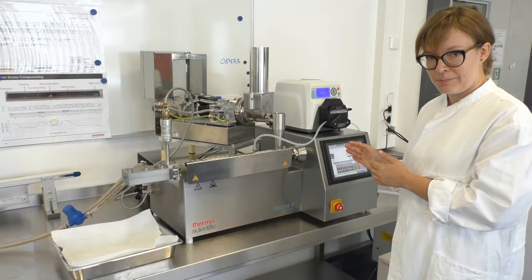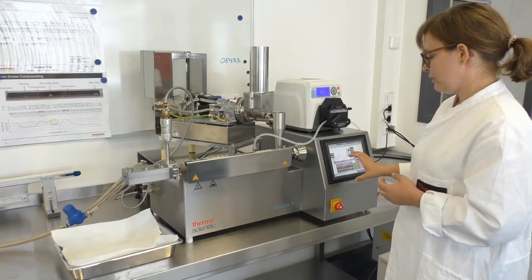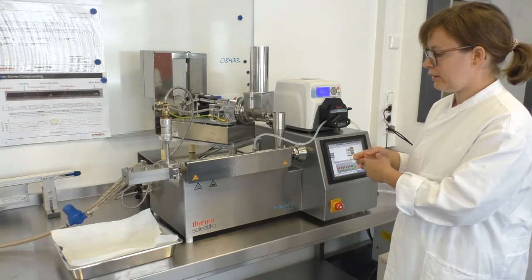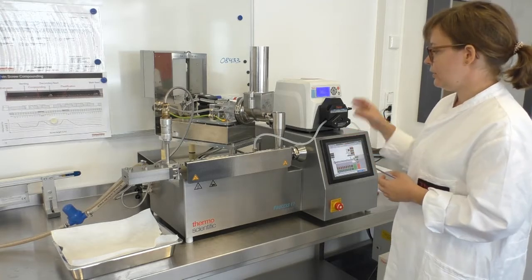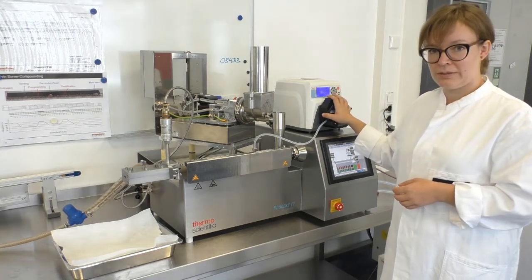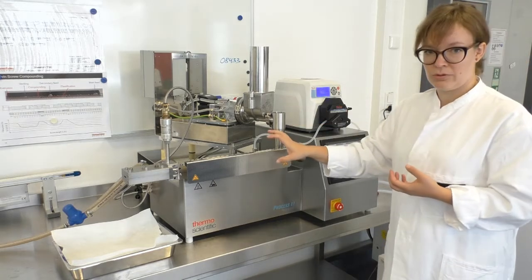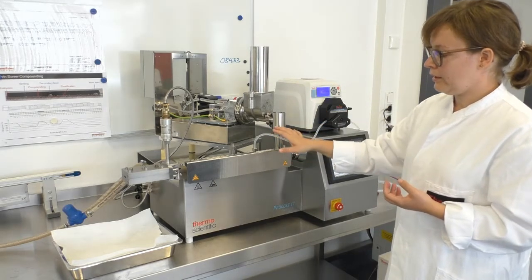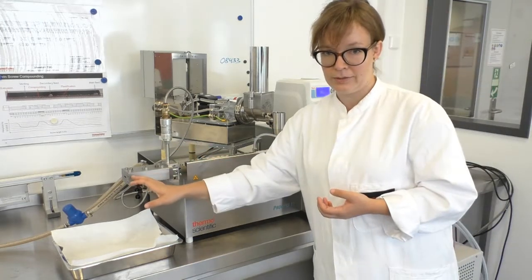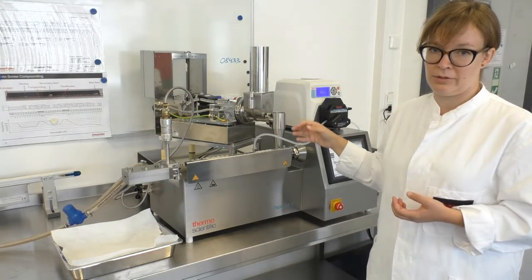So, as the next step, now I want to start running the process. What I would do first is start the extruder by letting the screws rotate, and then the next step is that I start with the liquid feeding. And here it's important that we always start with the water, because this acts as a lubricant and avoids that the extruder blocks if we only feed powder. And then after making sure that water is inside the extruder, which we see by water coming out of the die, I will turn on the gravimetric feeder and add the powder to the process.